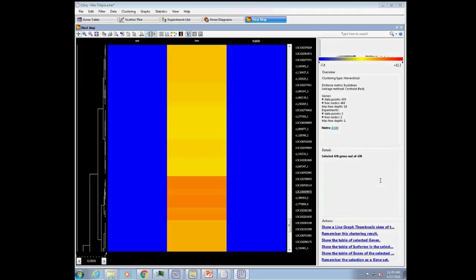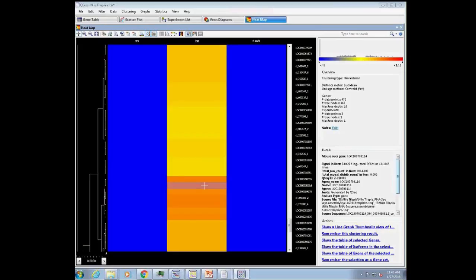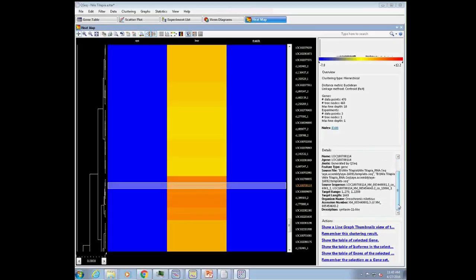What I can't quite show you though is that, see if I can change my scale on my screen here isn't quite letting me see the description. The description is visible down at the bottom, but my resolution on my screen isn't allowing me to do that without, there we go. So I can see that description that we just imported into the RNA-Seq project. I'm getting the organism name, and I'm getting the description of that gene. So that, again, is new annotation information, and it's pulled into the project.